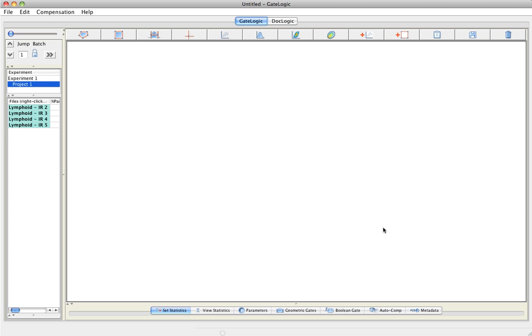Welcome to GateLogic's basic tutorials on how to find the FCS file in File Inspector. To the left you have the imported FCS files in the File Inspector. If you right-click, you can change the order of the files that you have imported.